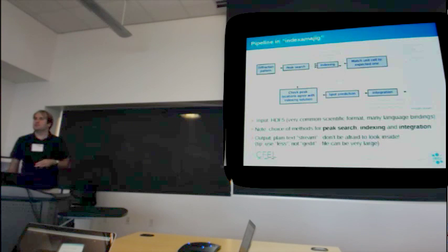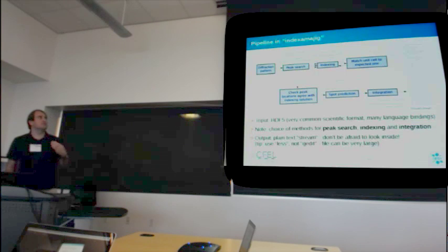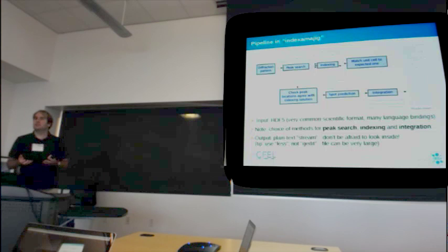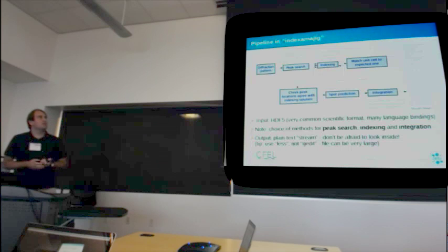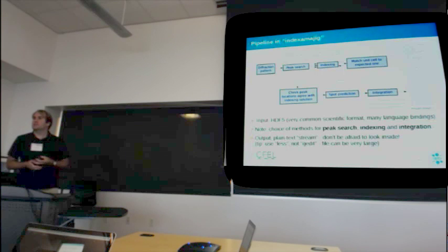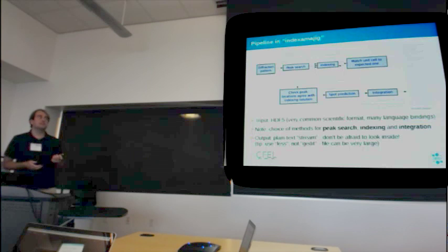Then the pattern is indexed, which means we give these peaks to external indexing programs. At the moment, there's an option to use MOSFLM, DirAx, or XDS. What we're doing there is taking advantage of the developments from these programs and getting really good indexing results. So rather than implement the algorithms directly within CrystFEL, we run these programs, and it seems to be very successful. We check whether the cell that comes out of indexing is the same as what we want it to be. If it's not, we go back to the indexing step and try a new indexing method.